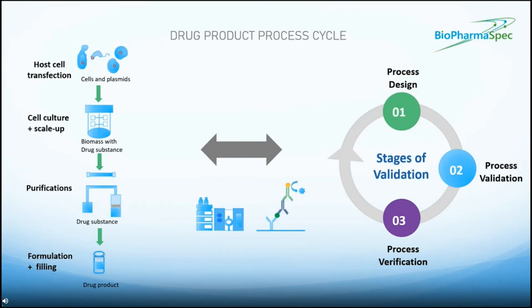And then it's also recommended that you monitor HCP numbers throughout the different purification stages to show that there's clearance of impurities, and in doing so better understand the control strategies used. And, you know, as a consequence of that, encourage improvements that minimize levels of HCPs.